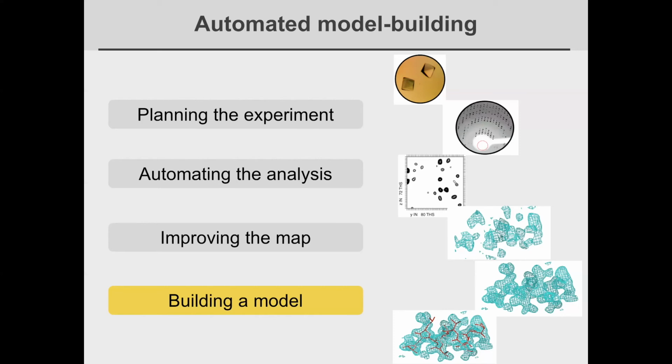So there was a question, maybe we can answer it. Can Autosol also accommodate a molecular replacement solution into its phase determination in cases where just using some heavy atom binding sites? Yes, so this is the experiment that's termed MR-SAD. And yes, in Autosol, you can do that in several different ways, but yes, you absolutely can.